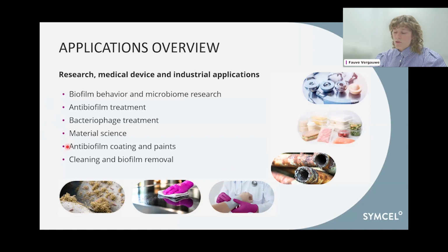In material science, it can also assess the biofilm formation on diverse surfaces, and it's also ideal for studying antimicrobial coatings and paints, or for evaluating how well a cleaning procedure worked at removing a biofilm. So it's quite broad. This can also be applied into different fields, so that's quite nice.